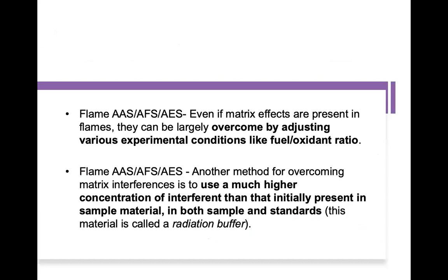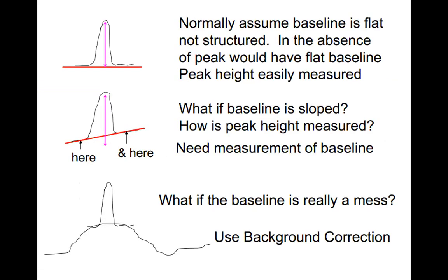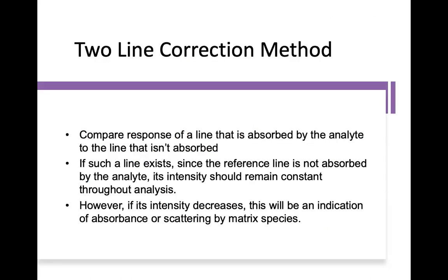Another thing is viscosity. If the sample is too viscous, then it's difficult to introduce in one shot into the atomizer. Even though you have nebulizers, due to the viscosity there might be some delay for all of it to be atomized at one time. That's why we work with low concentration samples. Usually we don't have issues with this because now we have good software, right?